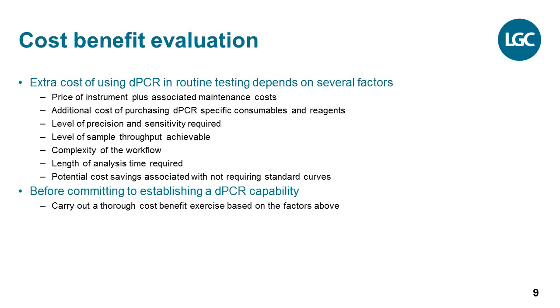If you are considering establishing a digital PCR capability, then implementation of a careful evaluation of the cost benefits for adopting the technique is recommended. Digital PCR utilizes many of the reagents common to performing conventional quantitative PCR. However, certain key components and reagents are frequently platform or instrument specific and need to be taken into account when determining the likely operating costs of an instrument.